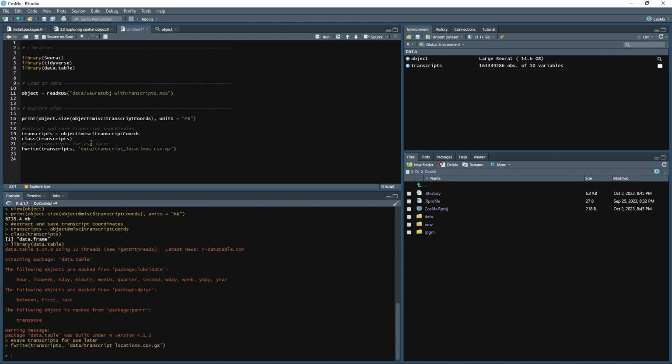And then once this is done, perfect. We can go ahead and clean the environment. We'll do this a few times, that way we don't end up with too big of an environment here. We can already see that it's at 21 gigabytes, and that's not something that I'm very comfortable with. I do have enough, but for the sake of everybody else, it's not ideal.